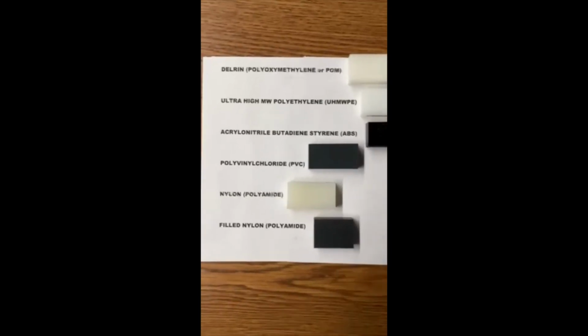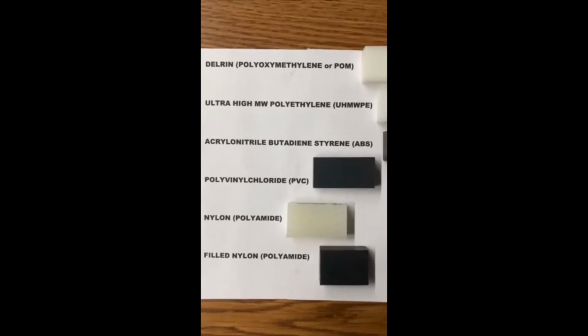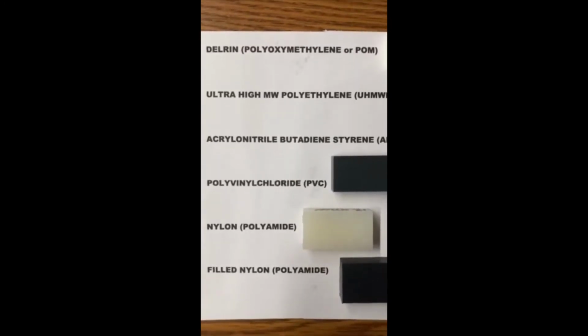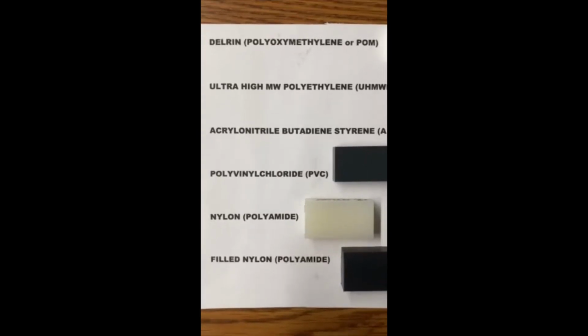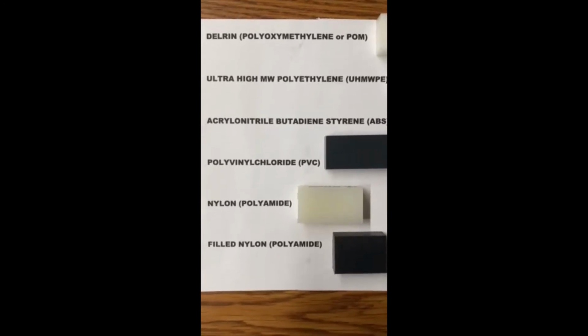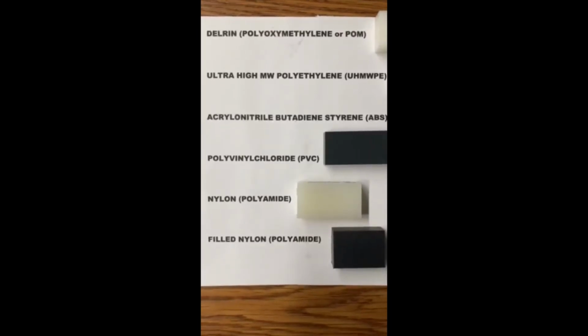Recall that density is mass per unit volume. So for this, we've made samples of each material in a rather simple geometry, either rectangular prisms, as shown here for the polymer samples, or cylindrical rods that we've made for the metallic samples. As we go through the lab, we will be measuring the dimensions of each sample in this manner that will allow very simple calculations of the density.